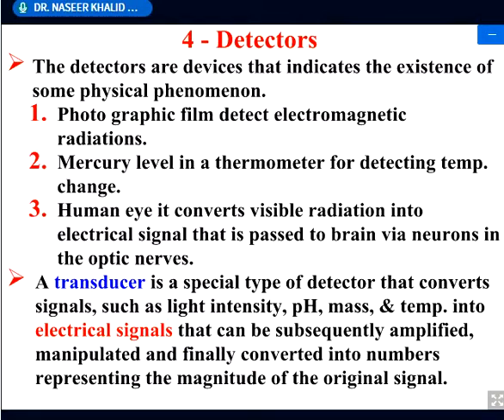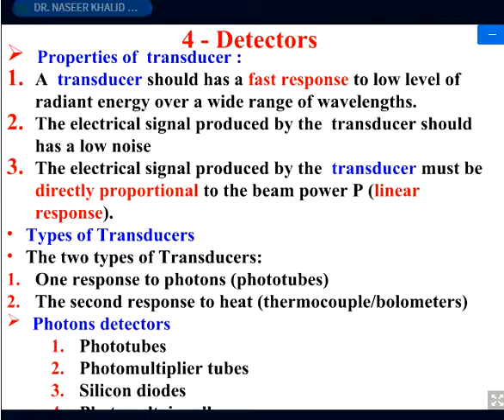Okay. Detector, and now the requirements. What are the requirements? The transducer should have a fast response to low levels of radiant energy over a wide range of wavelengths.